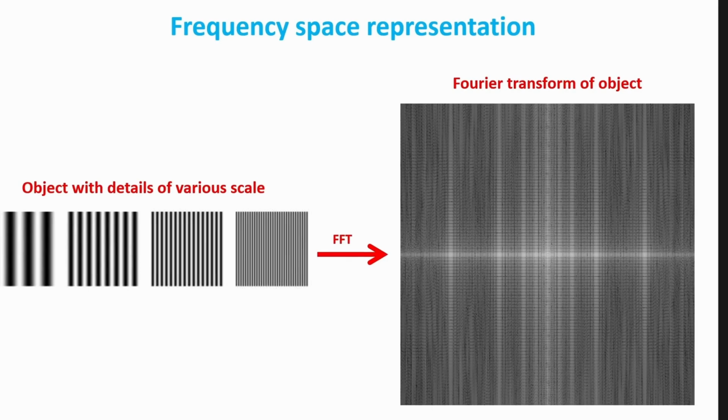for example, stat image. Here is the principle, and now I can a little bit more deeply explain what I started to explain in the morning. When I look at an image, for example, I picked here periodic images, like a striped muscle fiber. When I look at these images, I can convert this into a so-called frequency space. Frequency here means how far the various spatial components are from each other, inverted.